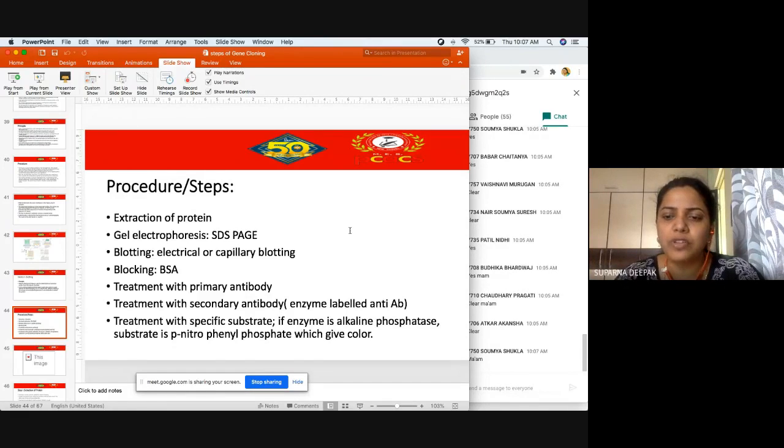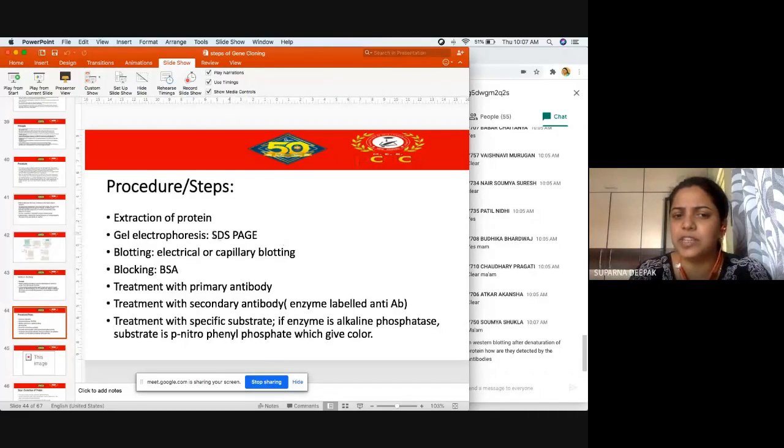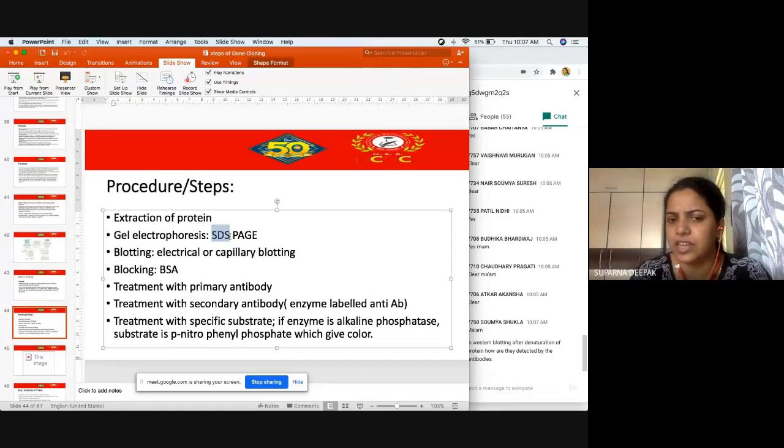Yes, Soumya wants to say something? Here you are not doing denaturation, no? You are talking about SDS-PAGE. SDS-PAGE, because of the use of SDS, denaturation. That's what you are talking about?